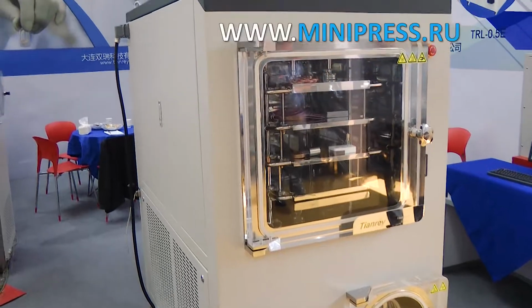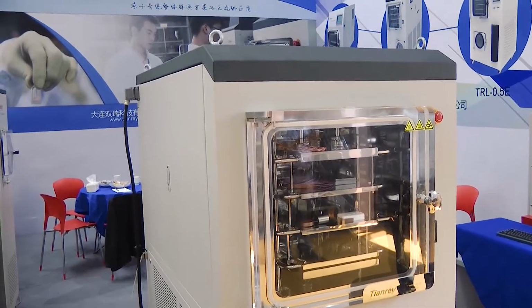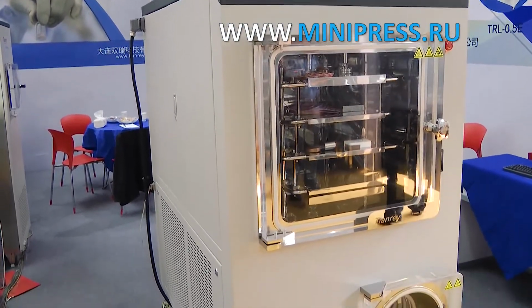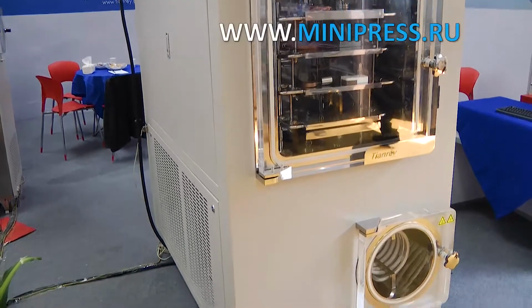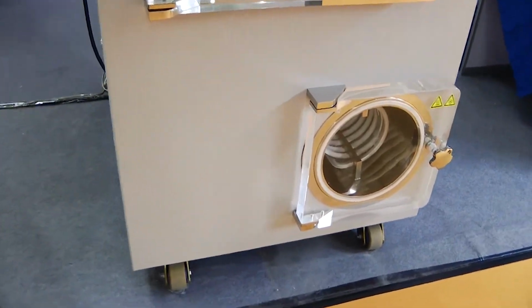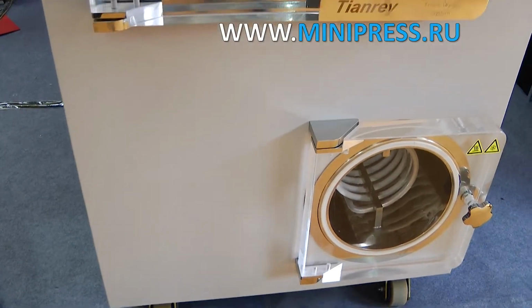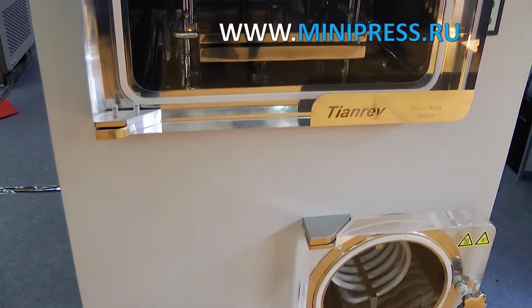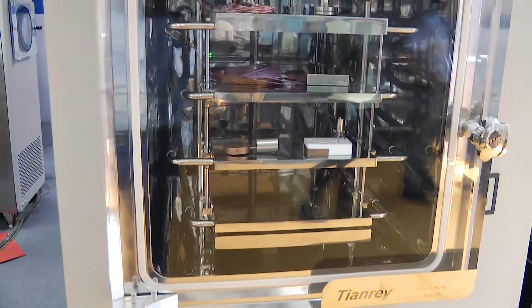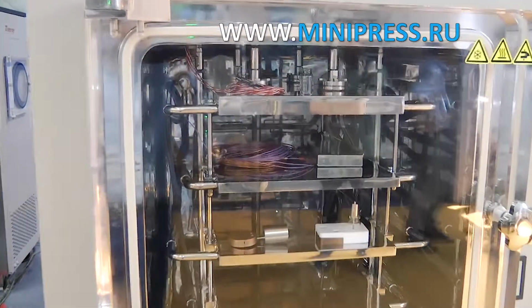Our pharmaceutical production plant in Kaliningrad has been working in the pharmaceutical market for more than 10 years. We use various pharmaceutical equipment that meets the requirements and standards of GMP for the production of products. At the general meeting on the development of production, the leading production engineer proposed to update some analytical and laboratory equipment. Using analytical equipment, they monitor the ratings of moisture level, melting time, transparency, dissolution, hardness parameters, thickness, viscosity.